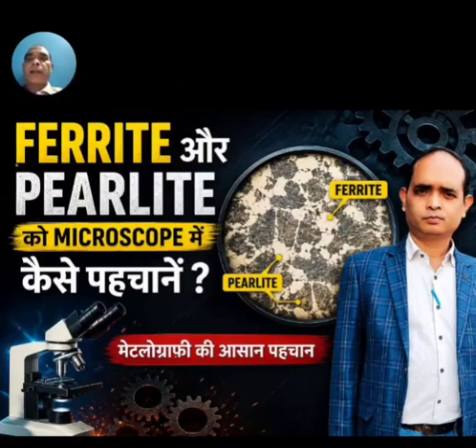Formation of ferrite and pearlite: when steel cools from the austenitic region, different microstructures form depending on the carbon content and cooling rate. In low carbon steel, ferrite begins to form first because the carbon content is low. As cooling continues, the remaining austenite transforms into pearlite. Therefore, the final microstructure usually contains bright ferrite grains surrounded by darker pearlite colonies. The amount of pearlite increases as the carbon content increases.